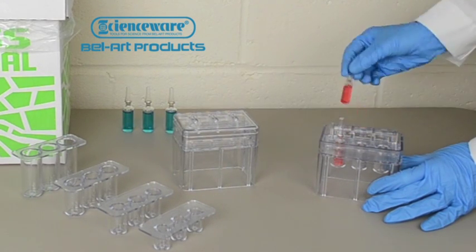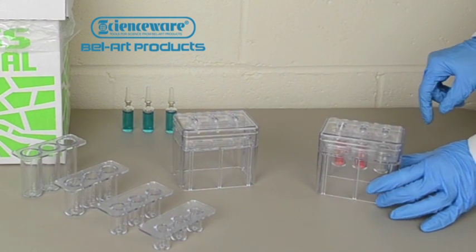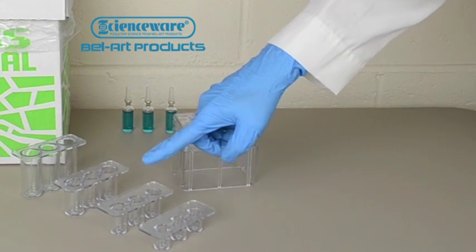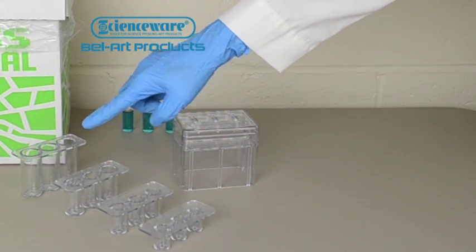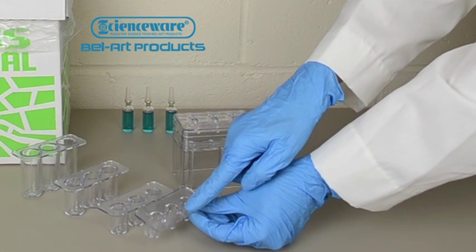Just place up to three ampules in the opener, apply light pressure, and your ampules are open. The device comes with four inserts to allow opening of 1 mil, 2 mil, 5 mil, and 10 mil ampules. An ampule size is indicated on each insert.